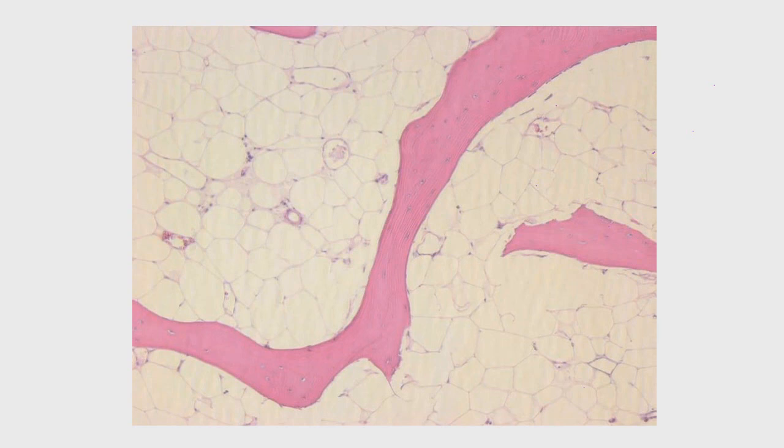Now, this sounds simple, but this really has to be closely monitored, particularly with bone marrow. And I emphasize this because, as I said, when I was first trained, this wasn't a science. Someone just told me, well, put it in there, and then when it's soft or you can bend it, you can take it out. I didn't learn till later about the specifics about the staining patterns and so forth.